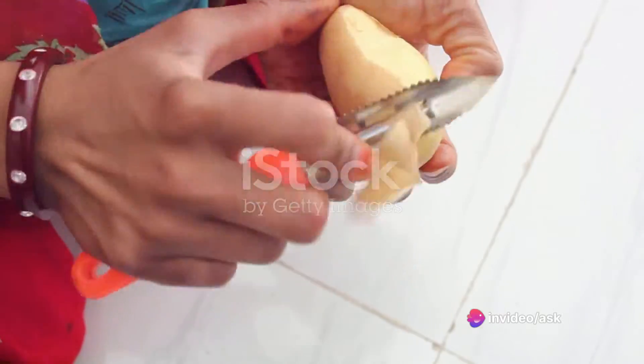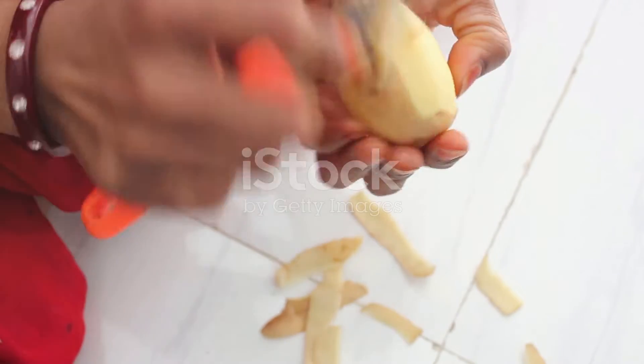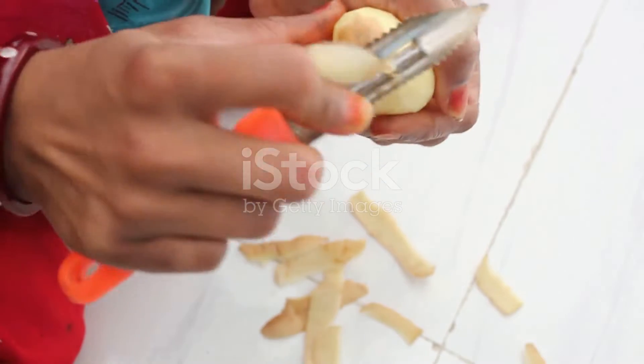After the time has elapsed, remove the potato cylinders from the beakers with a pair of forceps. Dry them with blotting paper, then measure their lengths and calculate the average for each group.